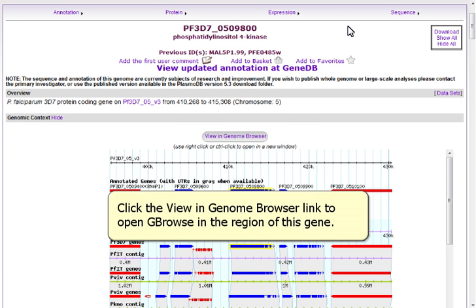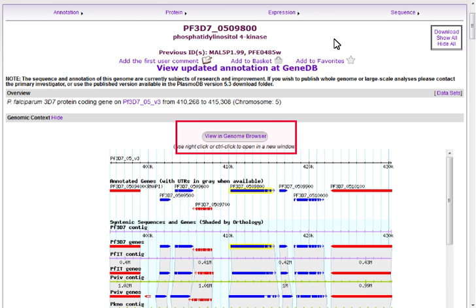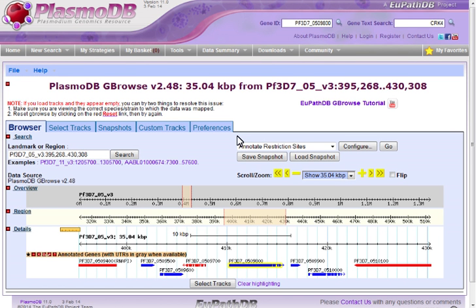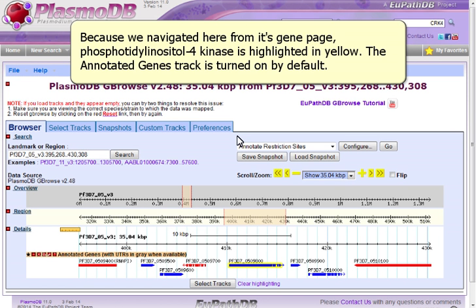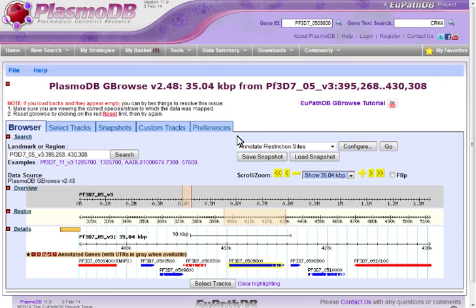Click the View in Genome Browser link to open Gbrowse in the region of this gene. Because we navigated here from its gene page, phosphatidyl inositol 4-kinase is highlighted in yellow. The annotated genes track is turned on by default.